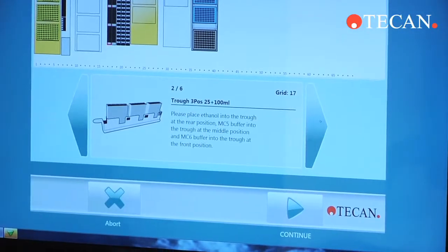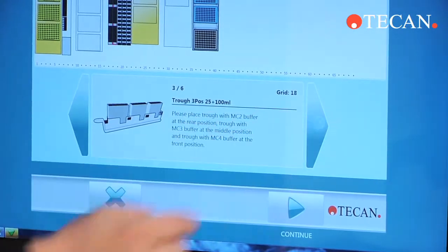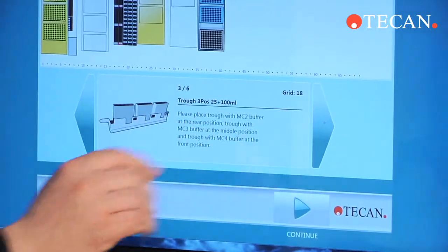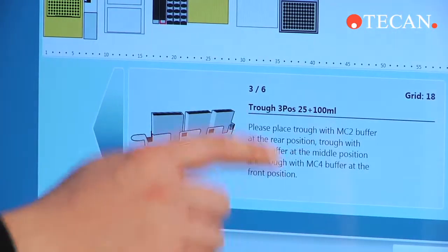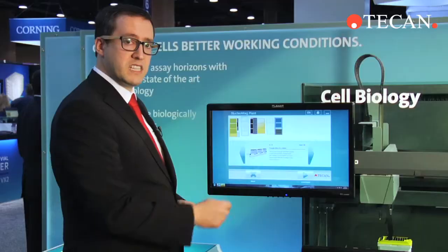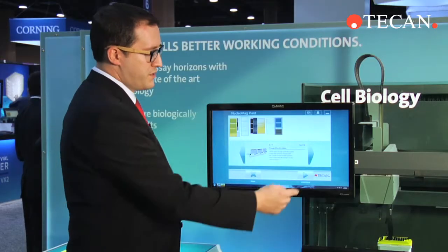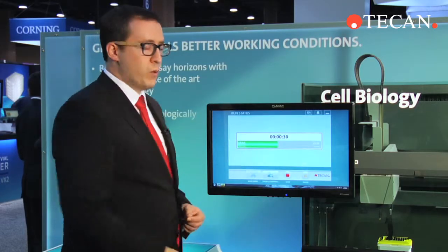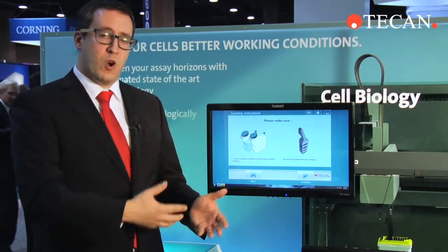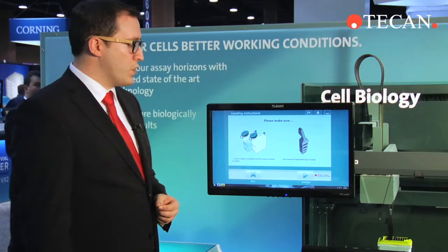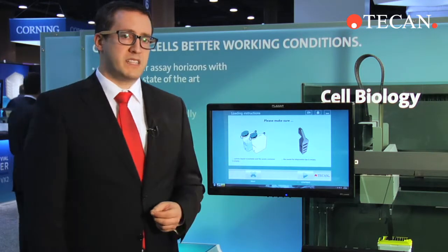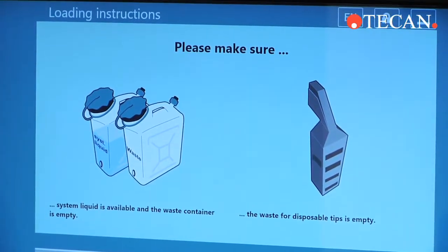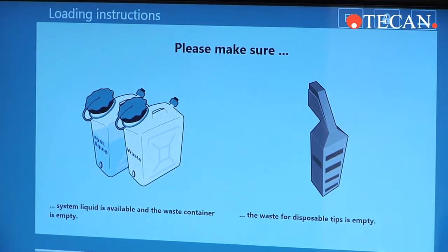Here we have a work table command where the operator can go through everything on the work table that needs to be set up ahead of time with customizable text and customizable pictures. Once the user has made sure that the robot is ready to run work table wise, you can give them some last minute steps like please make sure the waste bottle is ready or the waste chute is empty.